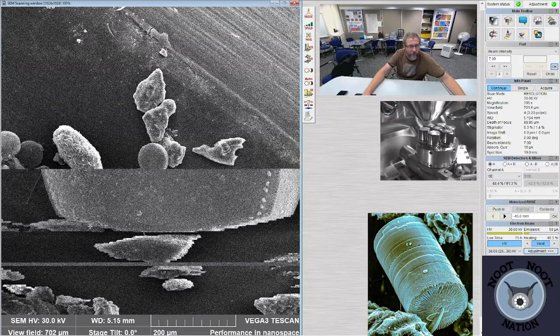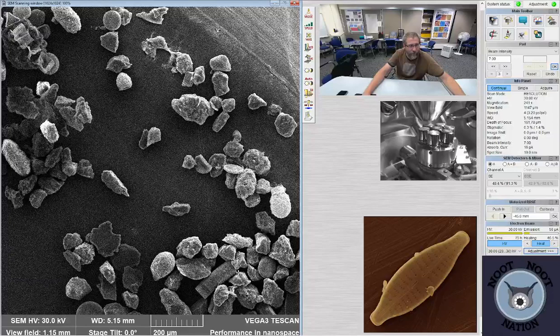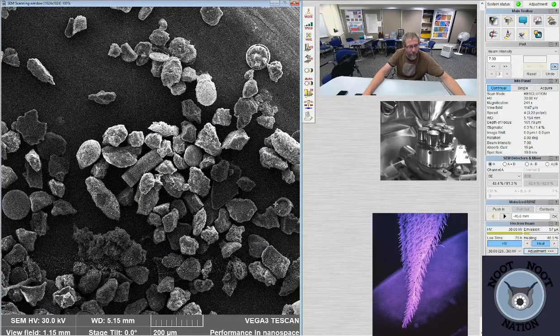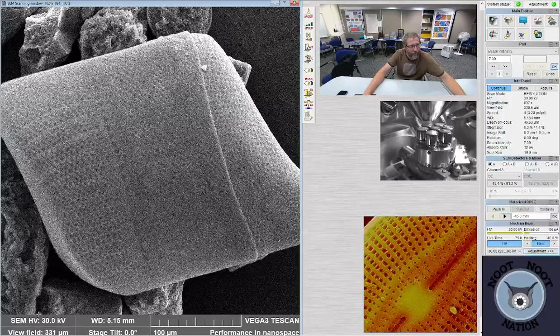There are some advantages and disadvantages, though. The disadvantage is that the organic matter can sometimes make it hard to see things in the skeleton. So sometimes it's a good idea to have a little bit of both. And there's a giant Isthmia that looks gorgeous, actually. Like the little emote that we have.